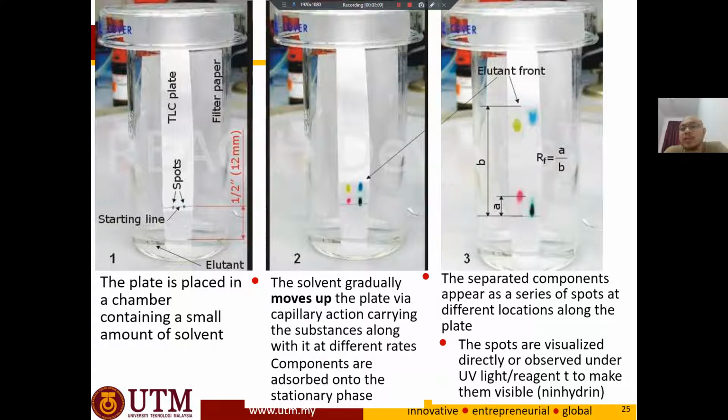So we perform TLC on the samples that we obtained. If, for example, they produce the same spot pattern, this means it is possible that the handwriting, maybe adulterated or tampered with, and the suspect used the same ink material. So that is the kind of example that I can give to you.